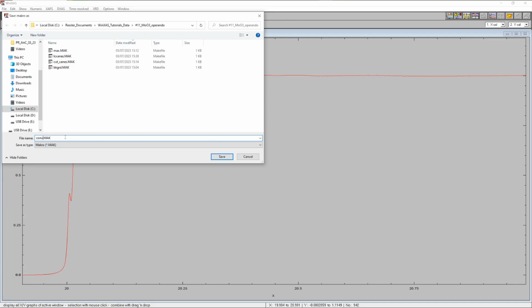And in general, I would recommend to break down the analysis into as many individual steps as possible and always verify the intermediate results, verify the spectra that you calculate in order to make sure that the procedure that you applied actually resulted in whatever you were expecting, and that there are no glitches or whatever in your data.